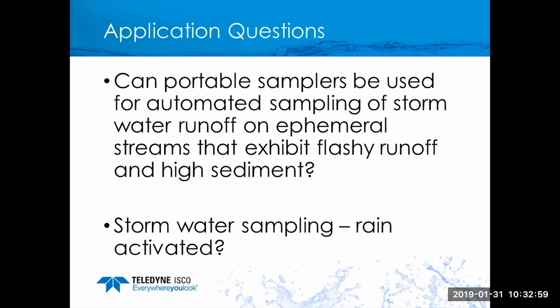If the depth of water is insufficient to fully and adequately submerge the intake strainer, given the choice of drawing in air or drawing in water, air is going to win every time, and you're not going to be able to collect samples. And in the end, you're just going to accelerate the decline of your battery charge unnecessarily by missing samples.